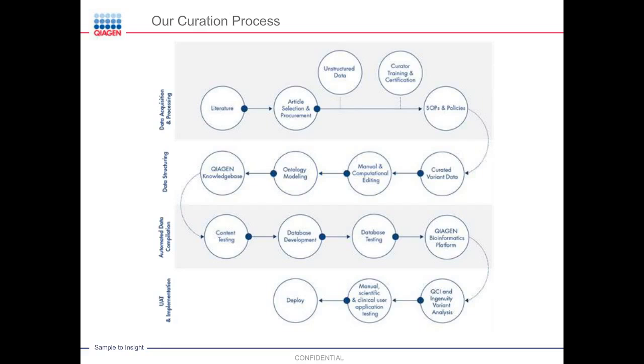That means you build connections between the terms, which allows you to use the information as part of our software. So for example, if a variant in a specific gene is known, and the gene is known with a specific disease, or the gene interacts in a pathway, and this pathway is known with the disease. This kind of relationship you can do if you organize all your knowledge in an ontology.